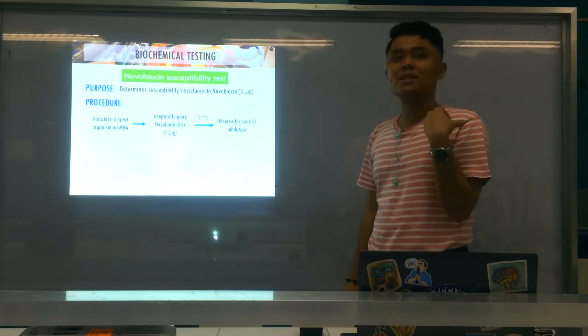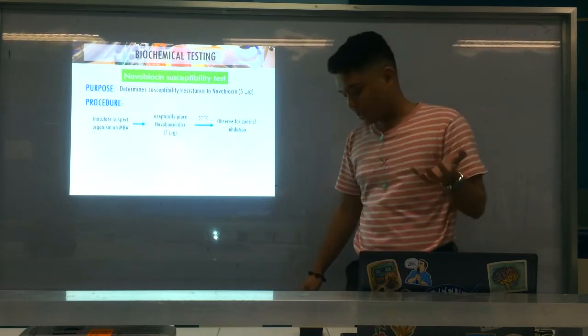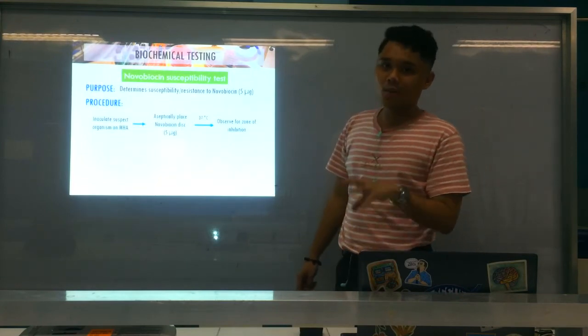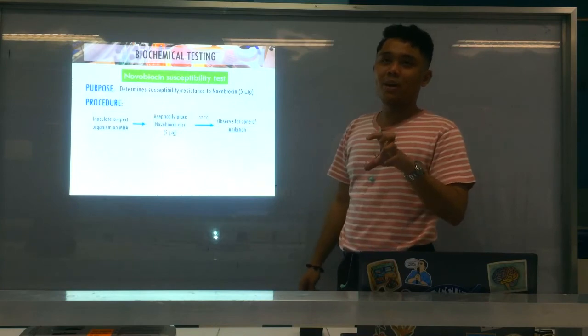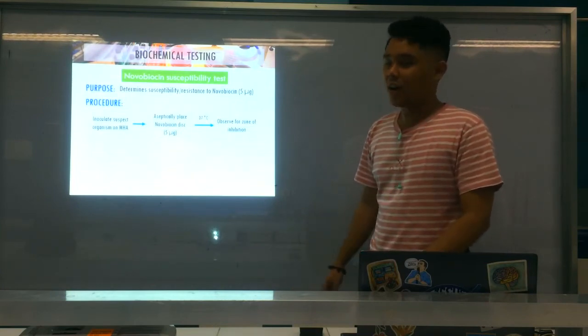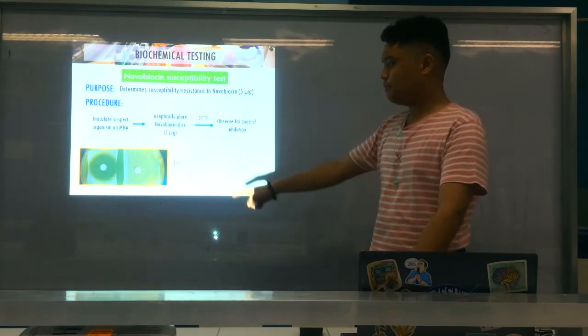You may be thinking, why is BAP used for bacitracin? Again, it depends on the test, on the antibiotic needed. But most of the antibiotic tests, or general antimicrobial susceptibility testing, we perform on MHA. Okay, for example, novobiocin earlier. Alright, observe again for zone of inhibition.